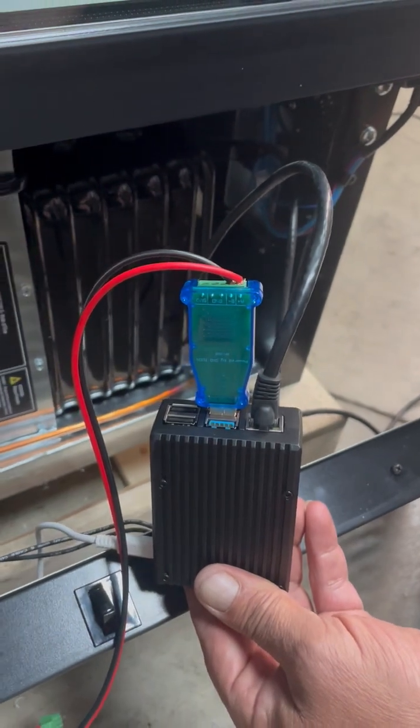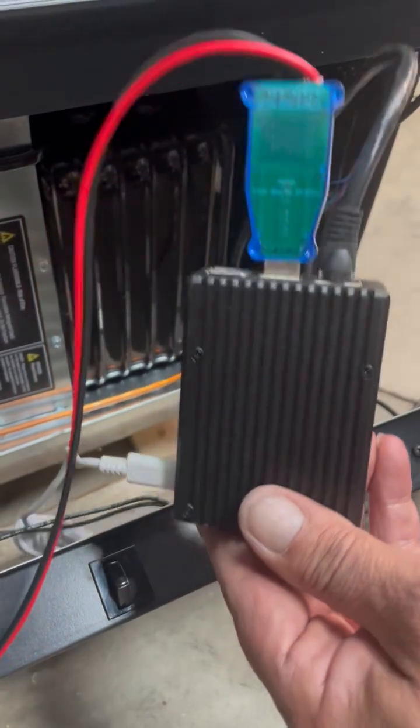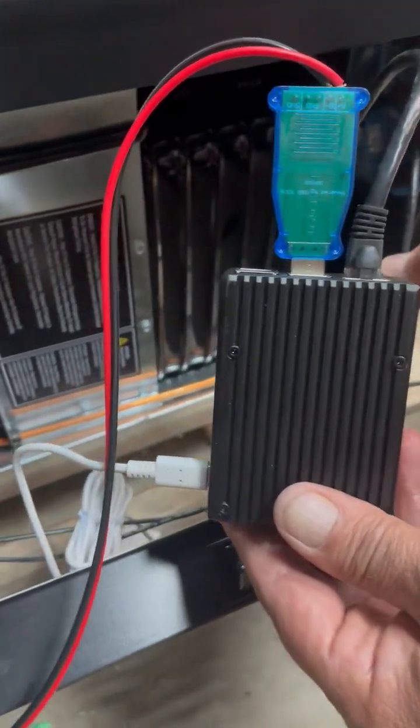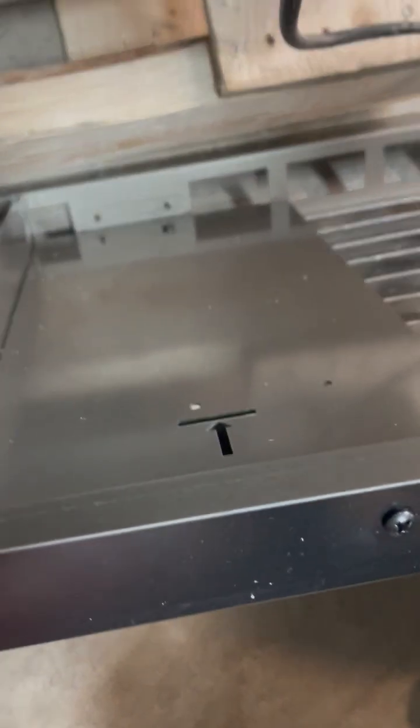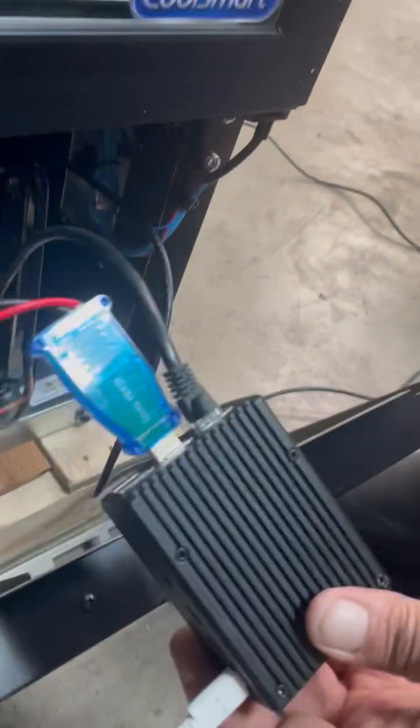And then connected to the wall in the back. You can also take the Raspberry Pi and mount it to the back side of the grill right here with double-back tape or velcro or something like that. Hope that helps, thank you.